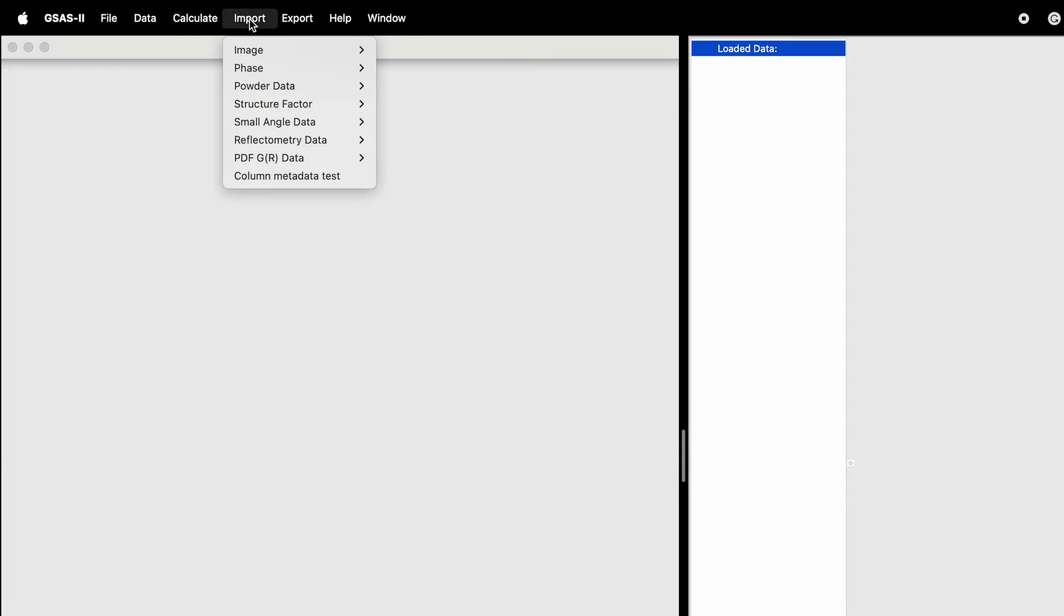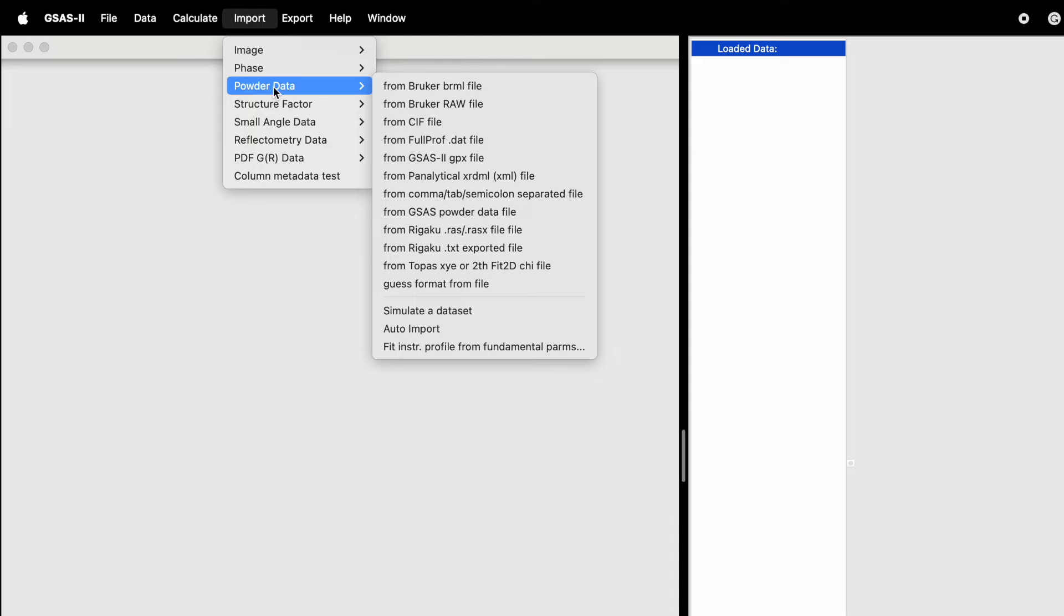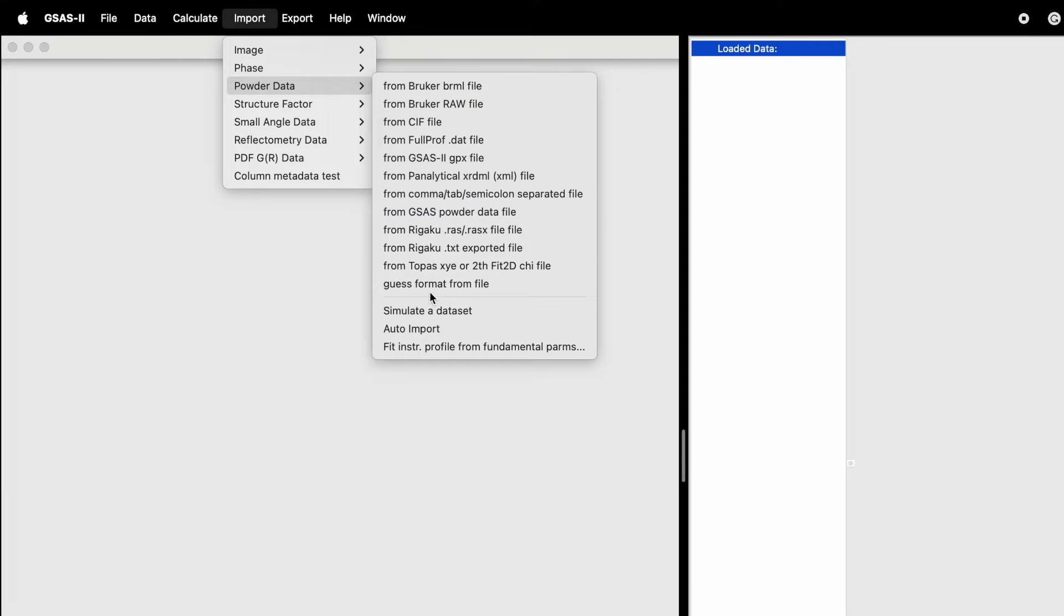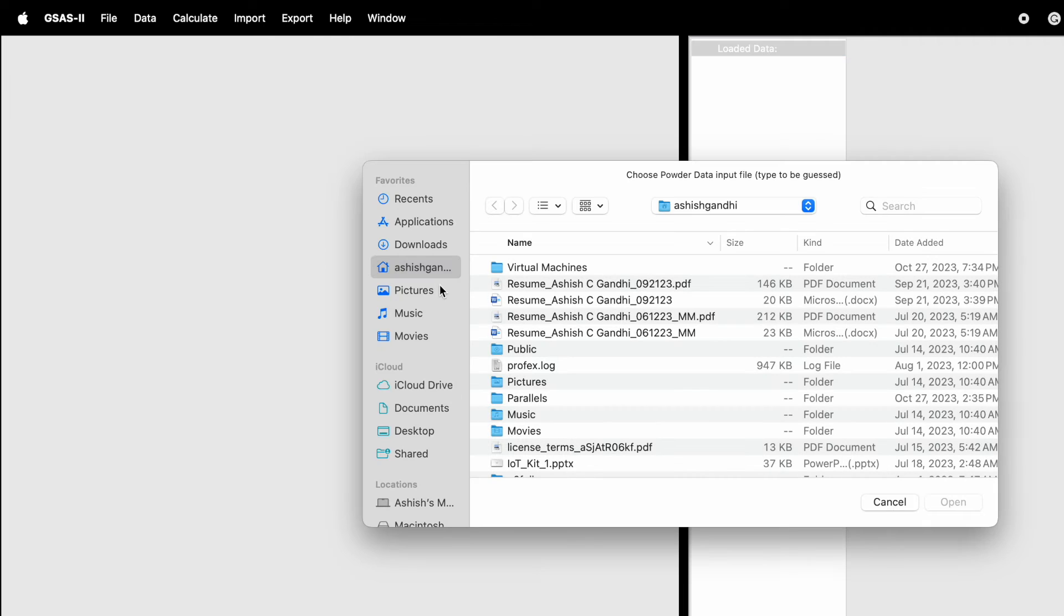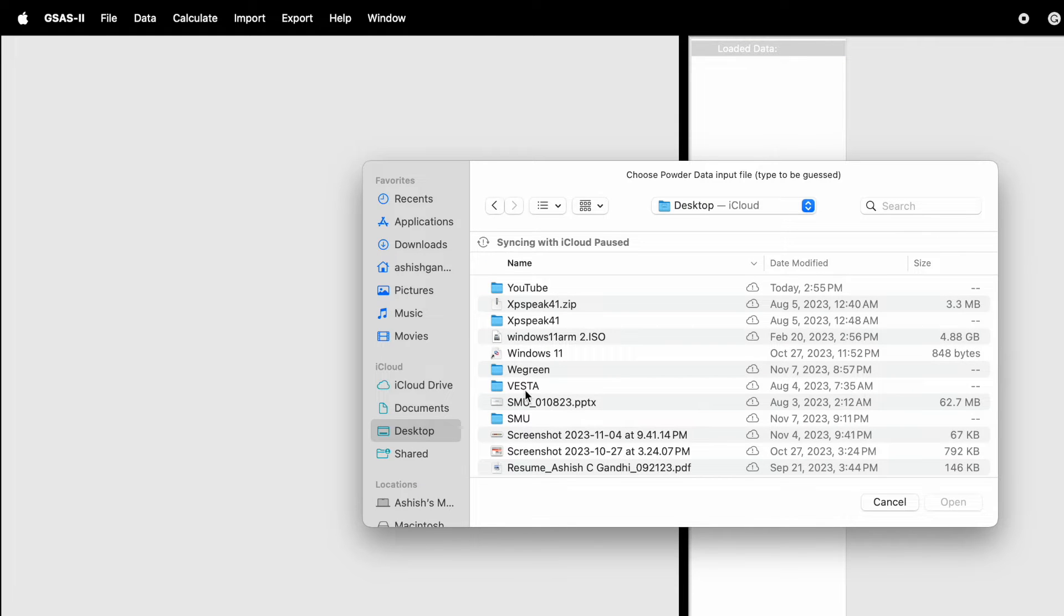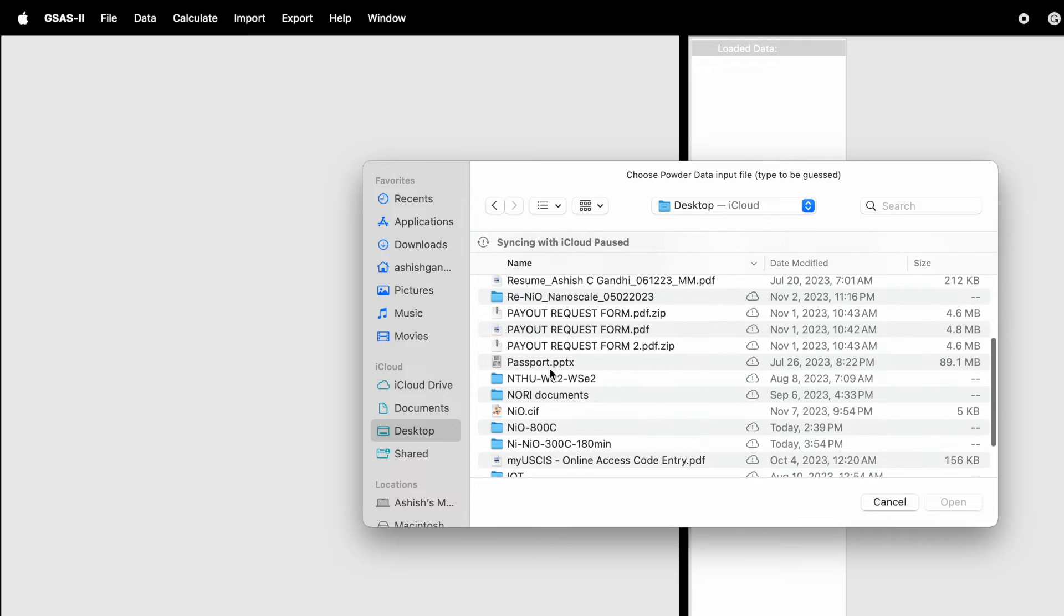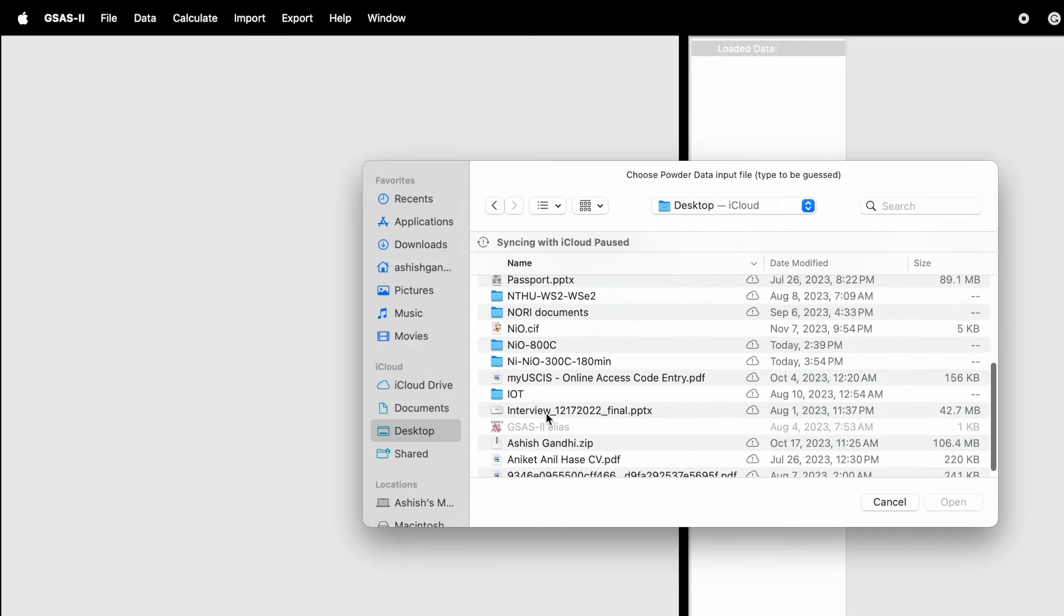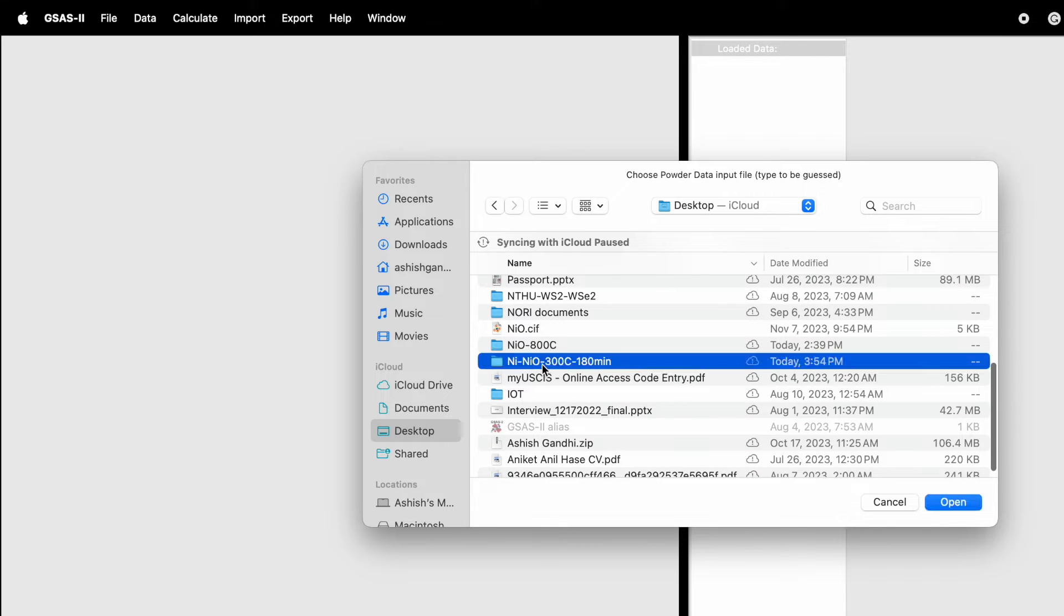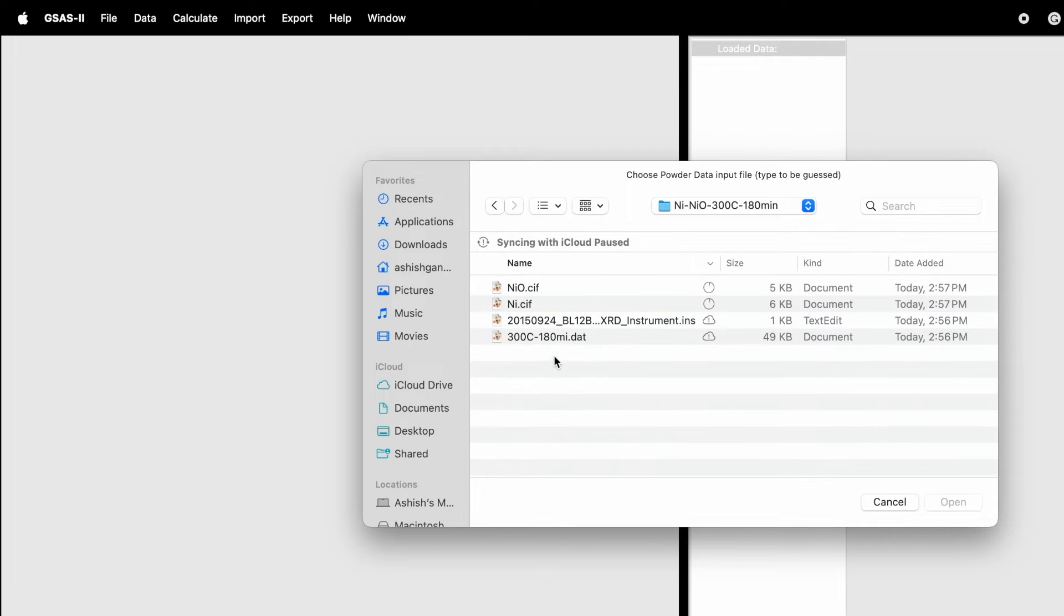To begin, click on Import, go to Powder Data, and click on Guess Format from File. The data is saved on the desktop in a folder called Nickel Nickel Oxide Sample.